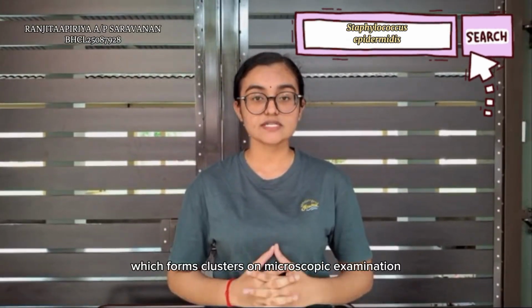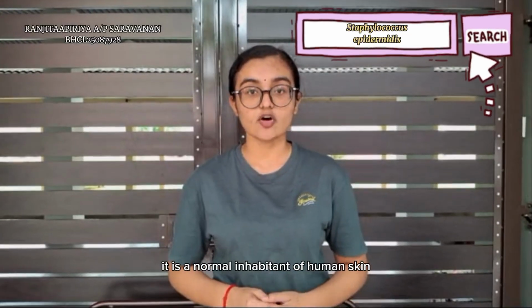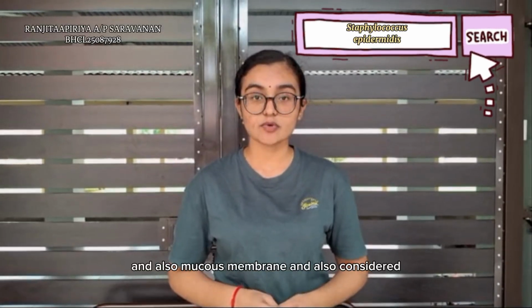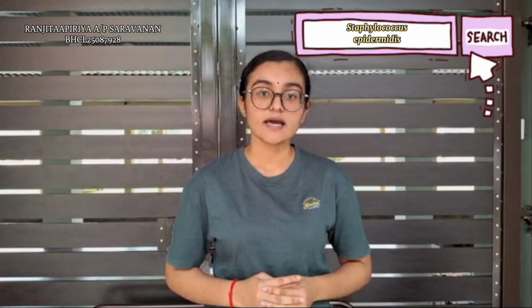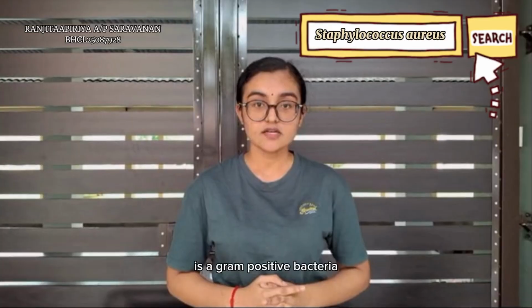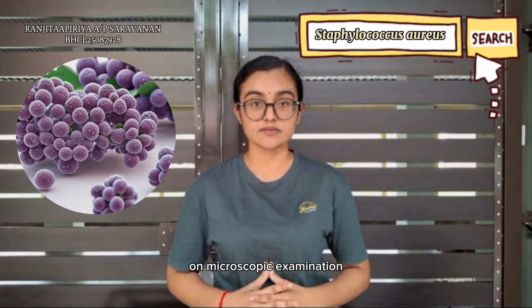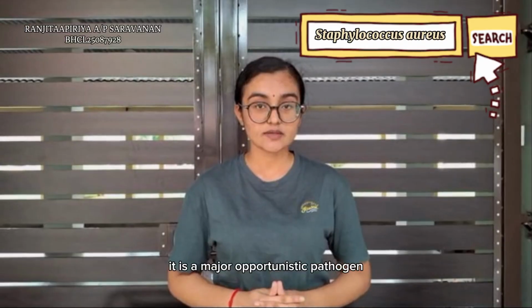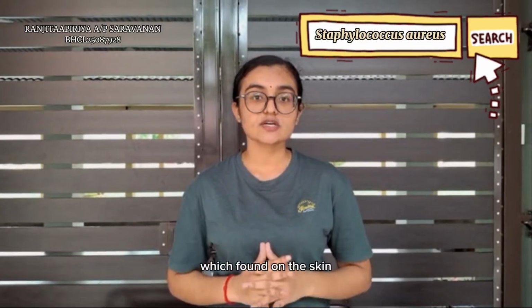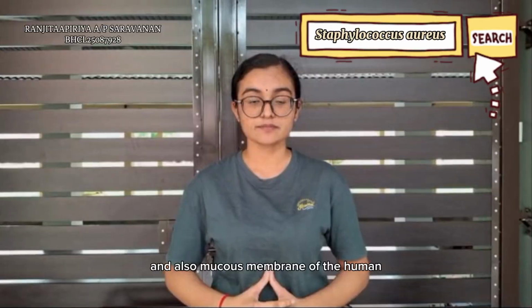Staphylococcus epidermidis is a gram-positive bacteria which forms clusters on microscopic examination. It is a normal inhabitant of human skin and mucous membrane, and is considered less pathogenic than Staphylococcus aureus. Staphylococcus aureus is a gram-positive bacteria which forms clusters resembling grapes on microscopic examination. It is a major opportunistic pathogen found on the skin and mucous membrane of humans.